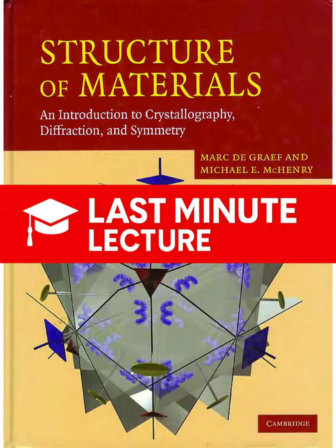It results from the random deceleration of electrons as they're scattered by the target nuclei. It's continuous because the electrons lose energy in all sorts of different amounts, producing a whole range of photon energies up to that sharp lambda min cutoff. So that's the general noise. But sitting on top of that noise are the sharp, intense spikes we actually use for diffraction. Those are the characteristic peaks. And these are the precise signals we want. Unlike the Bremsstrahlung noise, they originate from quantum mechanics.